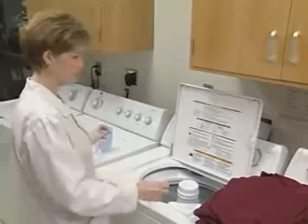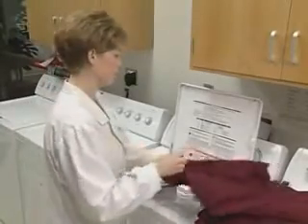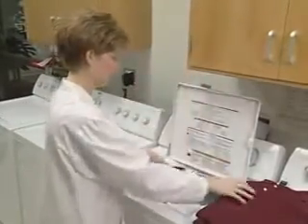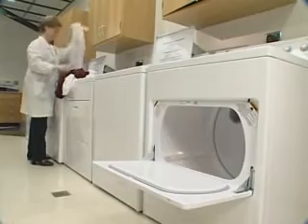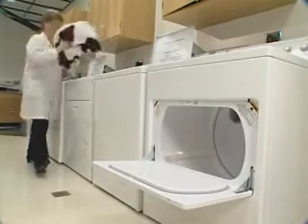Allow sufficient time for the detergent to mix with the water. Next, add the weighed sample load and close the lid. At the end of the wash cycle, transfer the washed sample load into a dryer.